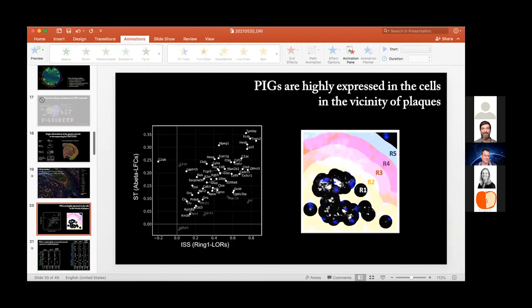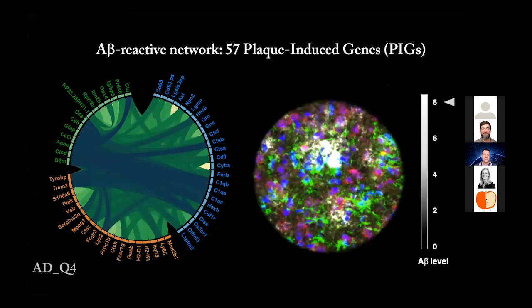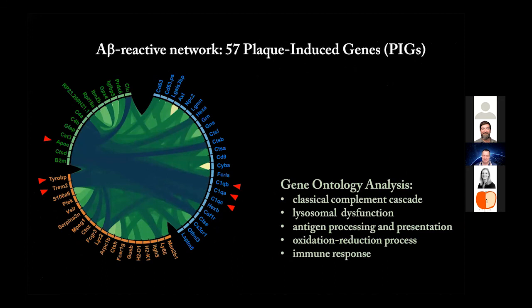Okay, so from our mouse model, it seems most of them are upregulated around the plaque. Yes, so regarding the function of the downregulated ones, if it's clear. Here it seems they are mostly all upregulated. But for the human brain, only about 14 to 16 of the genes are upregulated, and the others we cannot show replicated in the human brain.